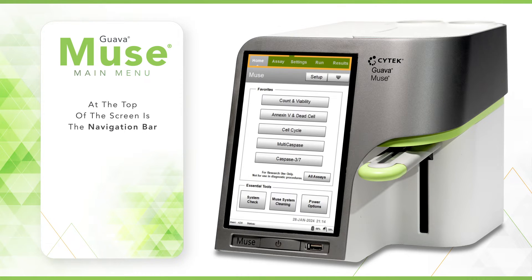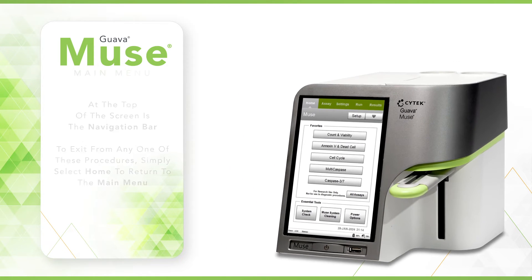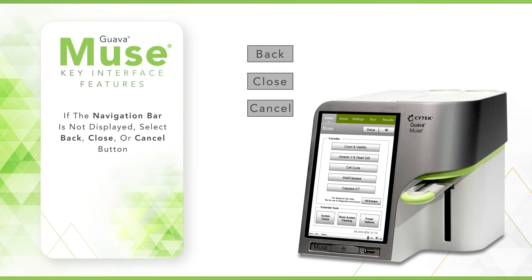At the top of the screen is the navigation bar. This indicates the progress of any given procedure. The current step will be highlighted in gray. If you want to exit from any procedure screen, simply select home to return to the main menu. If the navigation bar is not displayed, select the back, close, or cancel button to return to a screen with a navigation bar.